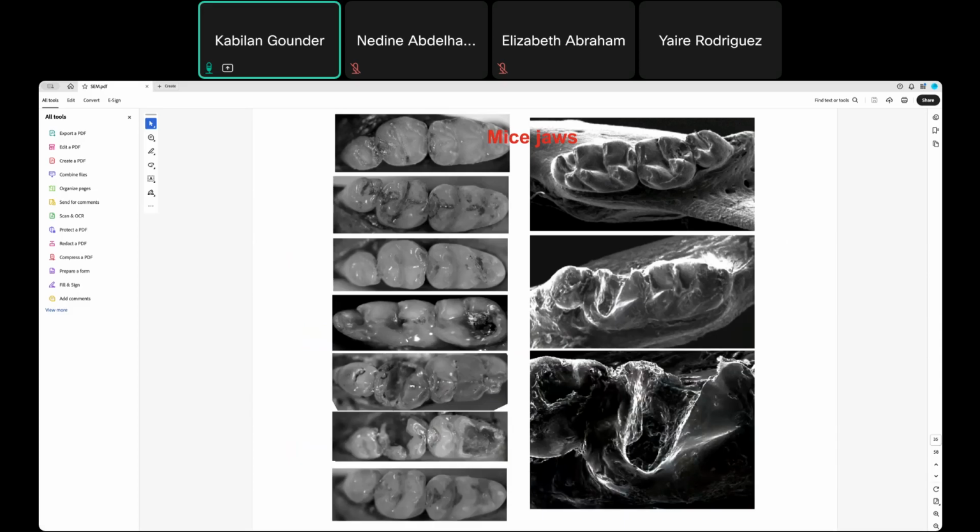So the left side, when you look at these structures, is light microscopy. That's a stereo microscopy, which lets you see the caries lesions in this tooth. If we really wanted to see inside how this carious tooth is, when you look here, you can see the detailed structure of the enamel and dentin areas in the scanning electron microscope.